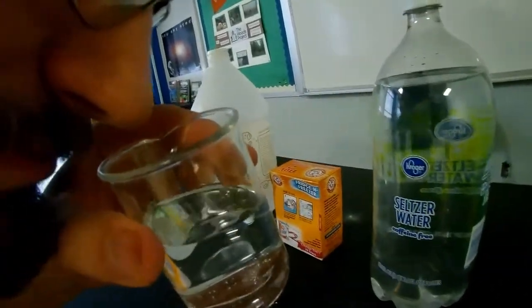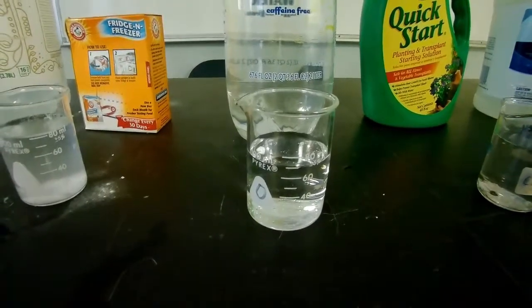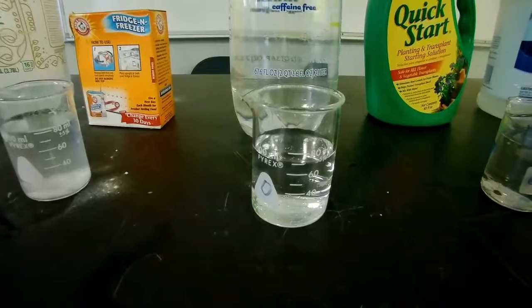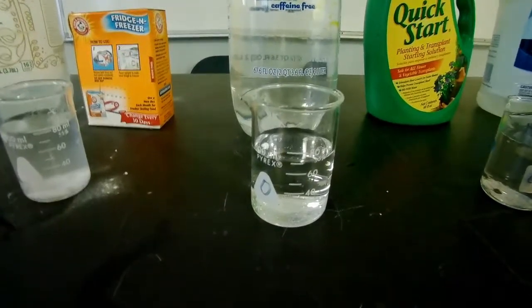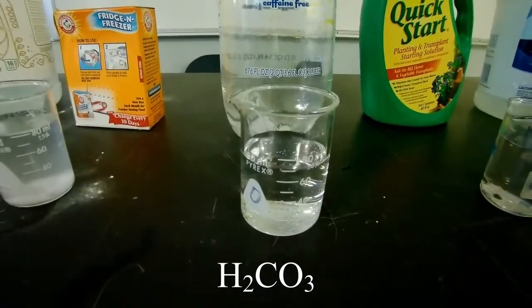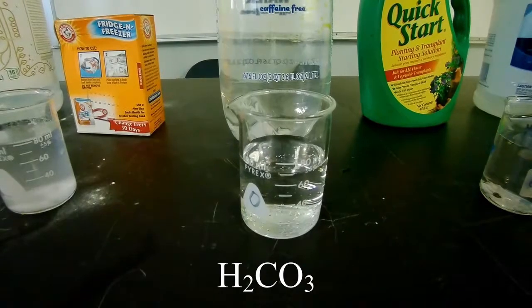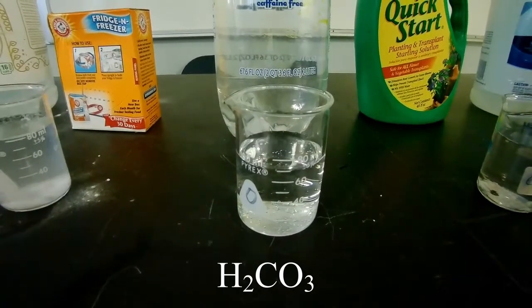We give it a smell. Doesn't smell like much. Smells a little bit grapey because it's grape flavored. And the chemical formula for this one is H2CO3. So let's write down a description and whether or not we think it's an acid or a base.